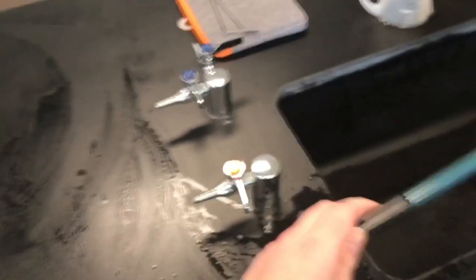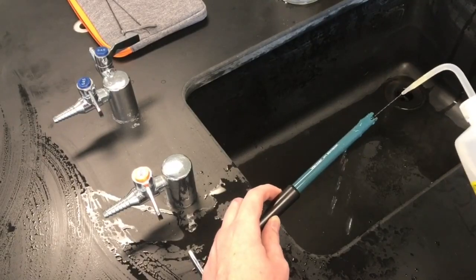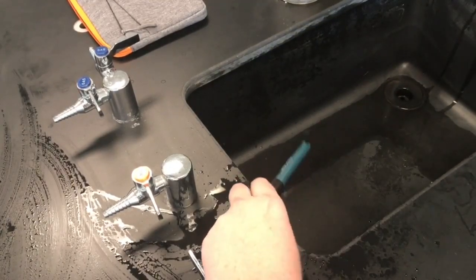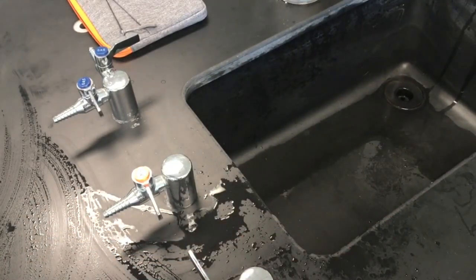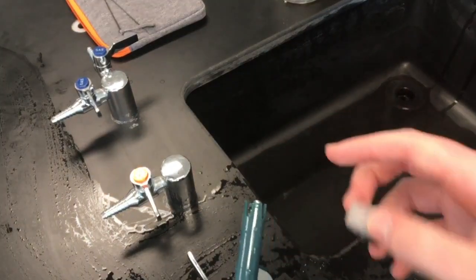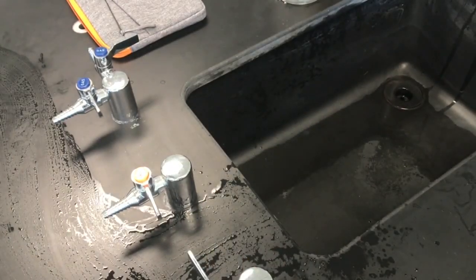Again, this is really, really important, especially for this last step here. I'm going to spray off my pH probe. Make sure to get the tip of the probe all cleaned off. And then I'm going to stick it back into the buffer solution here. Once we have our pH probe cleaned off here, and it's really important, make sure to spray this off with deionized water. I'll place the cap back on.